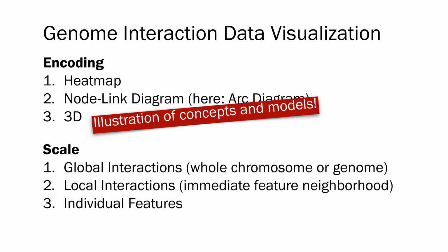Then you have to zoom in really far, but then you don't have an overview, and the overview is very hard to interpret. So there might be a way to combine these 2D approaches with matrices or node link diagrams or arc diagrams with a 3D representation, but it is hard to do any sort of global analysis with 3D. Those are my views.